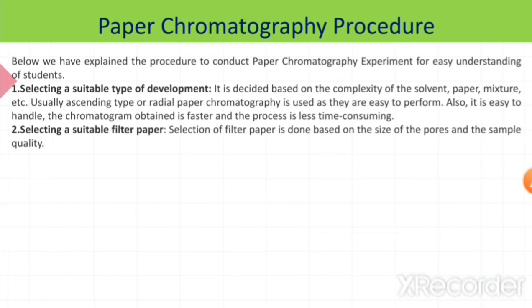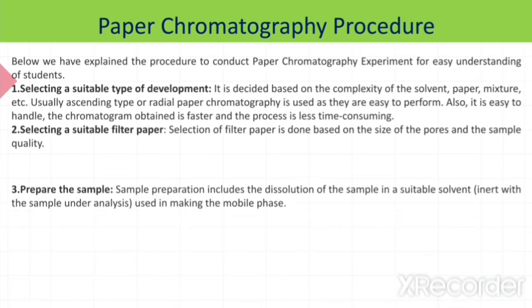Second point, selecting a suitable filter paper. Mostly in the labs we have to select a filter paper where the pore size and the sample quality should be matched, and on the basis of that we can easily separate out the sample molecules.